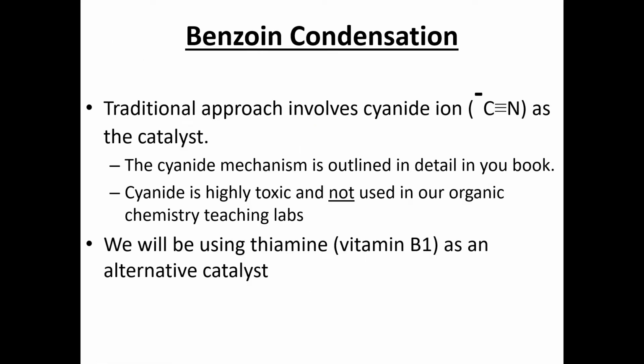So traditionally, the benzoin condensation is done using cyanide as our catalyst due to its strong basic ability. However, we can't really use cyanide in the lab because, as most of you know, cyanide is incredibly toxic.